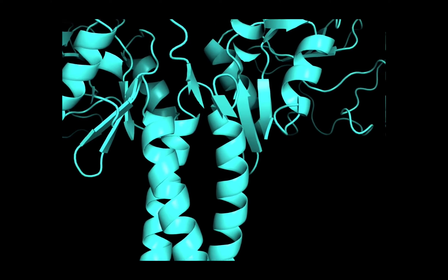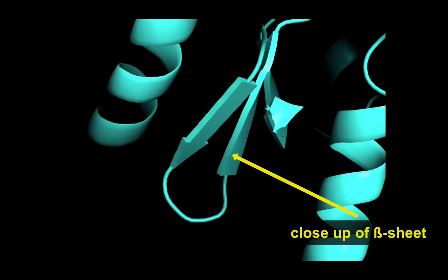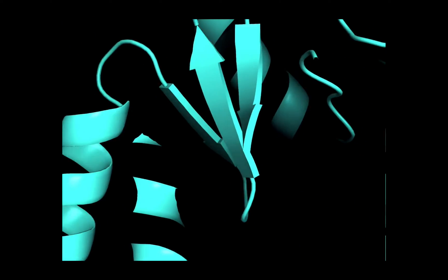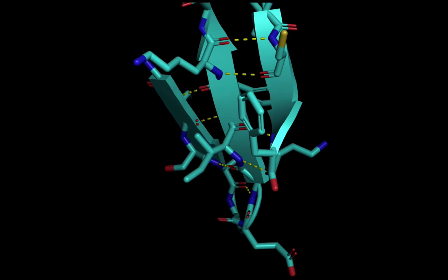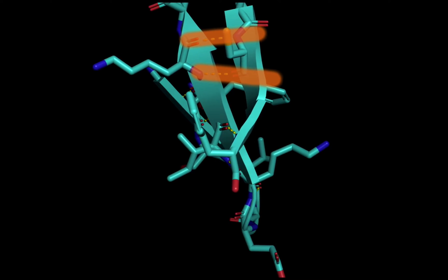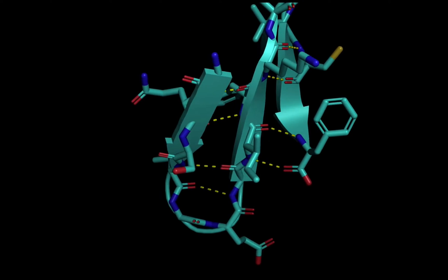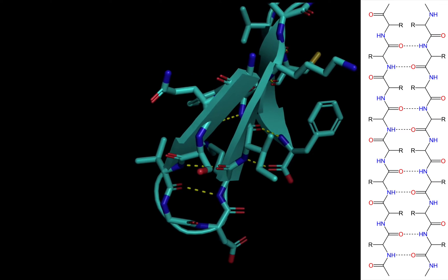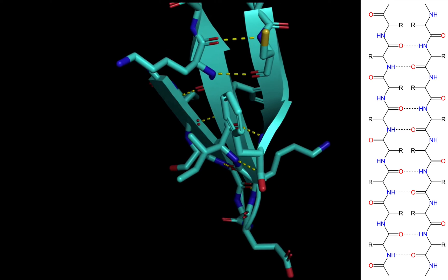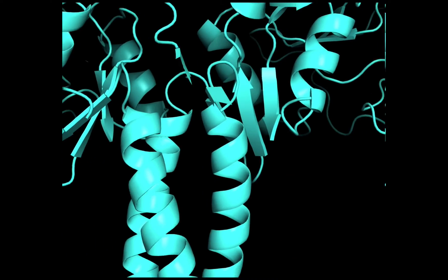Let's look at this beta sheet in a little more detail. Suppose we want to prove to ourselves there are strategically located hydrogen bonds that stabilize this beta sheet and hold the structure together. It's advantageous to zoom in and show the stick rendering overlaid on the ribbon diagram. Now we can add in the hydrogen bonds — I've colored these dashed lines yellow. Notice how they connect blue nitrogen atoms to red oxygen atoms. This is because the hydrogen atom is not shown for clarity. To understand this rendering, we have to know that the nitrogen is actually an NH group and there's a hydrogen atom making the H bond to the carbonyl oxygen.